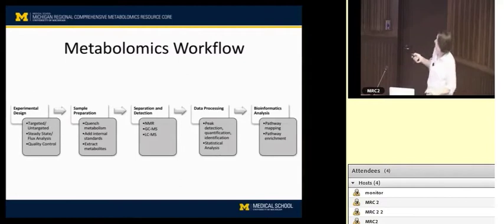Back here on the workflow diagram again, similar to what we did with the targeted analysis yesterday. The core does everything, including preparing the samples for analysis. I mean, everything past quenching the metabolism, this part. Right now we're talking quite a bit about peak detection, quantification, identification, and a little bit about statistical analysis because our basic report will provide some statistical analysis for you.